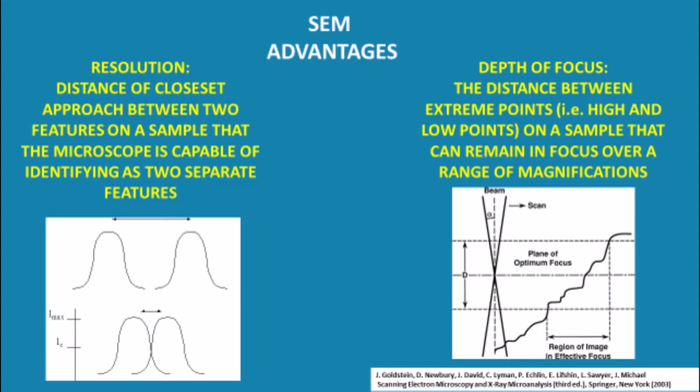A second advantage of the SEM is its improved depth of focus. This is the distance between extreme points, or rather high and low points, on a sample that can remain in focus over a range of magnifications.